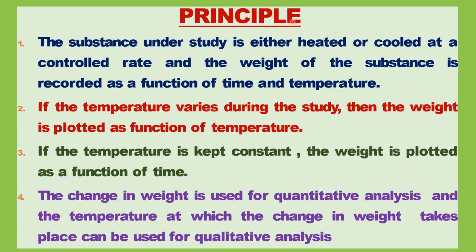We have earlier seen that if the temperature varies during the study, then the weight is plotted as a function of temperature. If the temperature is constant, suppose you keep the temperature constant, the weight is plotted as a function of time. The change in weight is used for quantitative analysis, and the temperature at which the change in weight takes place can be used for qualitative analysis.